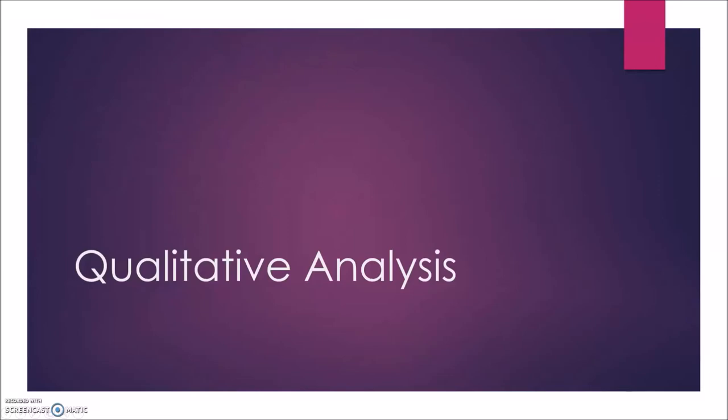Hi, I'm Pranav Ved, and this is the Qualitative Analysis app. First, let's discuss what qualitative analysis is.